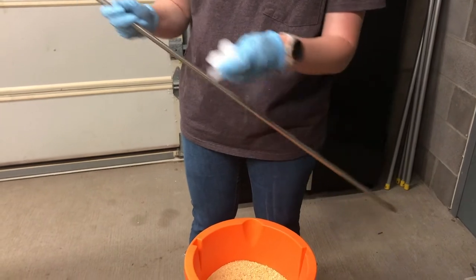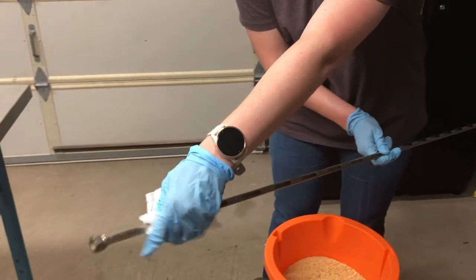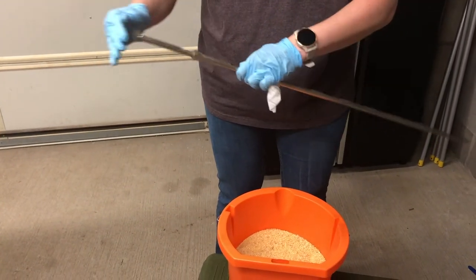Start by wiping the external and internal compartment of the double-sleeved probe with a disinfectant wipe. Once that is done, slide the internal compartment back into the external compartment.